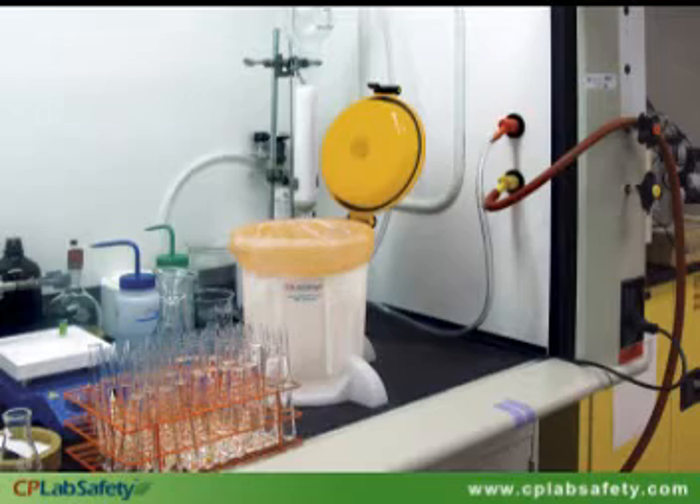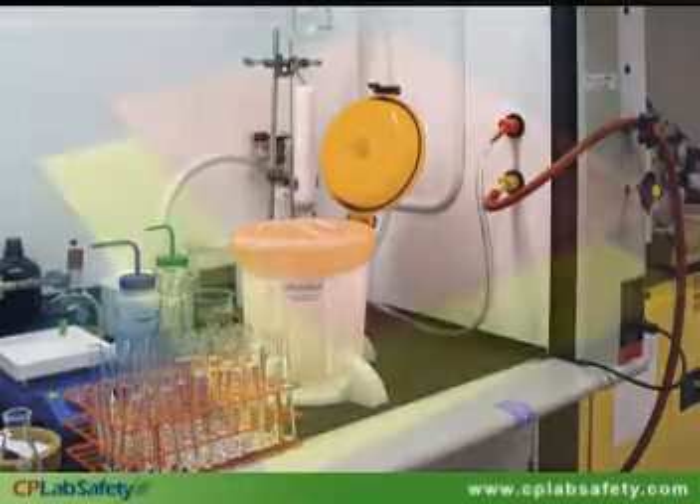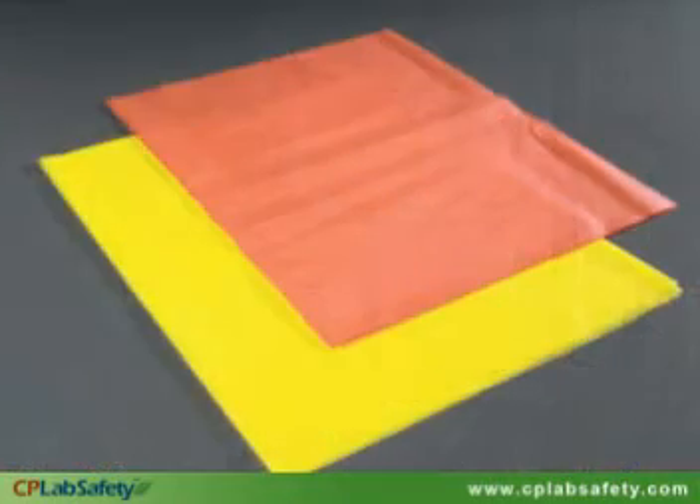It comes with either a red or a yellow lid, and features a sturdy hinge, positive latch, and inner gasket, just like EcoFunnel. Liner bags are also available in either red or yellow to match the lid color.